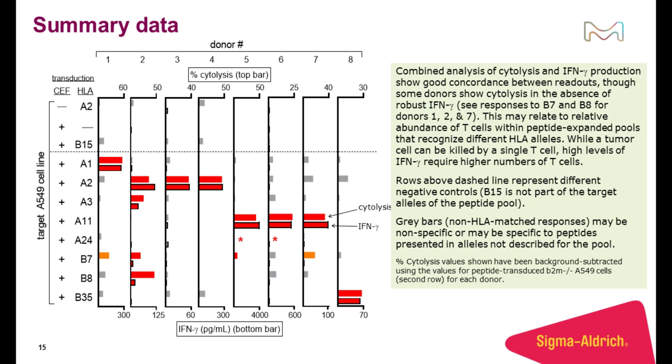So T cells generated from a donor with a known HLA type seem to be specific for killing cells of the same HLA subtype with this particular set of antigens. This indicates that something like a cell-based therapeutic targeting these peptides as an antigen would only be efficient if the target cells were of the same type. It would have to be specific for the HLA subtypes. There's one unique example, specifically with donor number 2, where there's some cross-reactivity between different subtypes, but we didn't explore this any further at this point. It seems pretty clear that the trend is, in general, to that specificity.